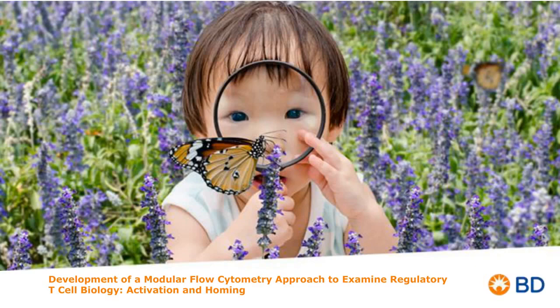And that allows me to actually start dissecting my traditional gating strategy in different ways, because I can see the data in a different way, and I may have a bias in excluding a marker that actually may be important and can tell me more information about the cells I'm interested in.